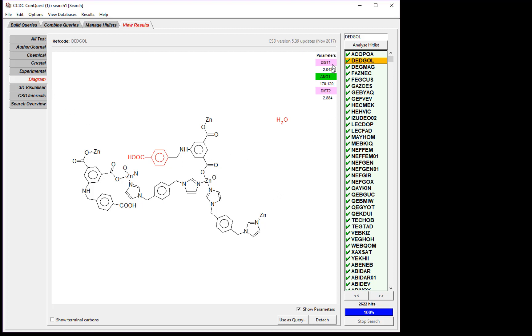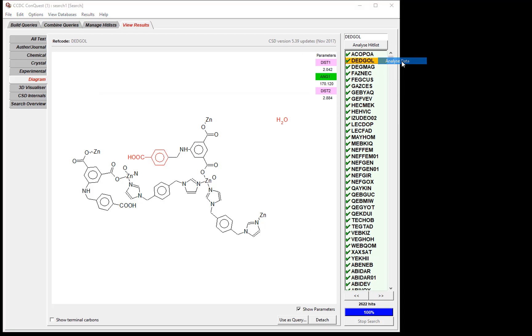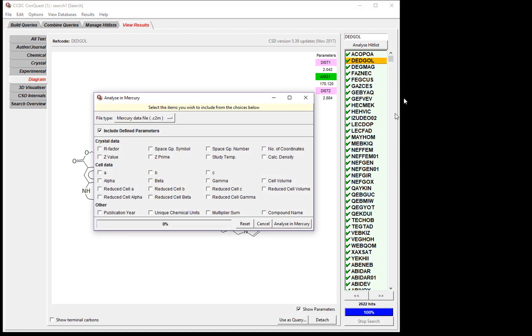Now we'd like to analyze the data that we've pulled from our search. To do this, click Analyze Hit List, and then Analyze Data. Here you see we can add other information about our entries from the CSD. We're not interested in any of this information right now, so we'll just click Analyze in Mercury.